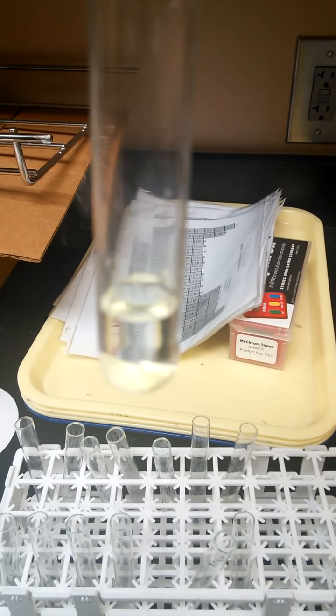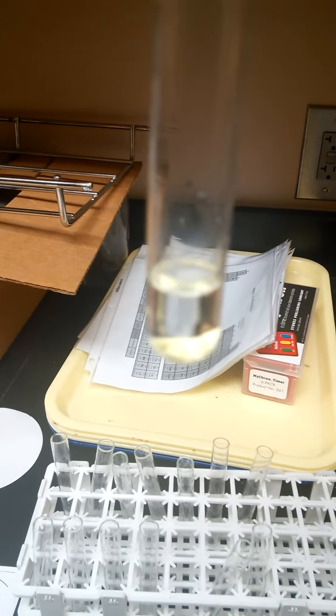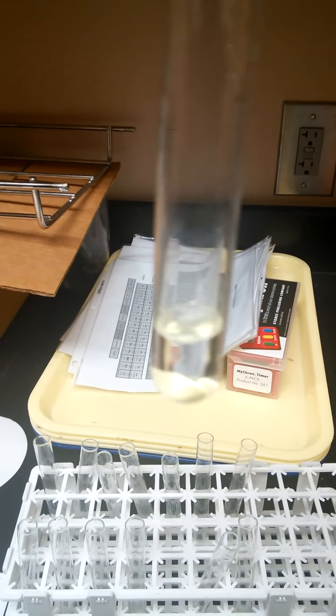So our next one, we'll use a little bit of this silicon. And we'll watch that. Silicon does not seem to be reacting with the hydrochloric acid.